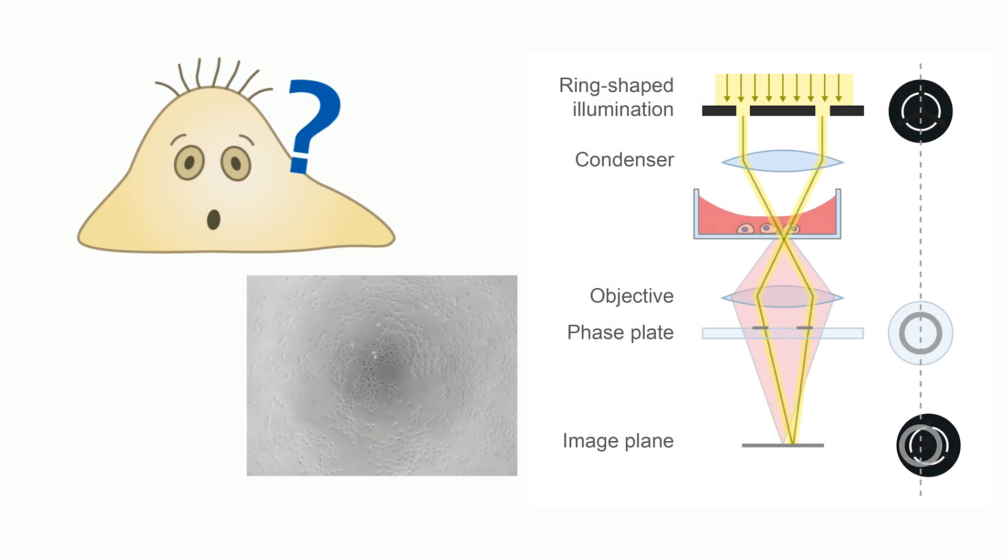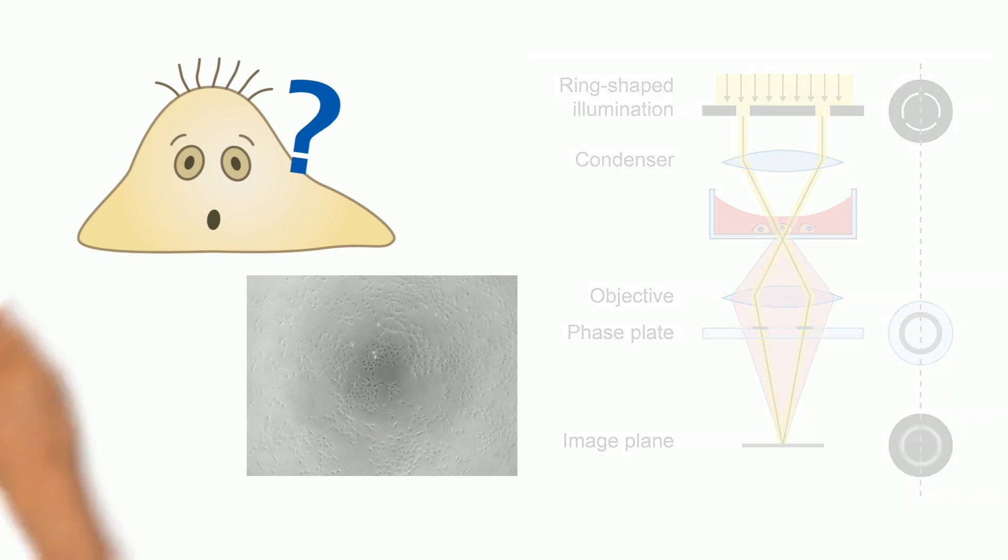It disarranges the correct alignment of the phase ring and phase plate inside the optical pathway. But how can you avoid the meniscus?